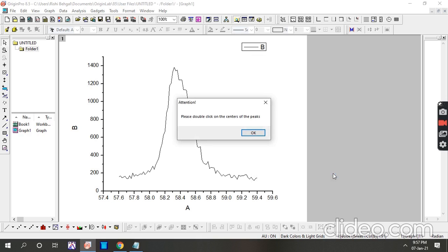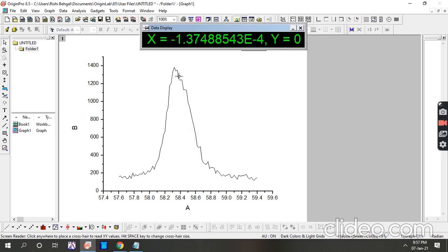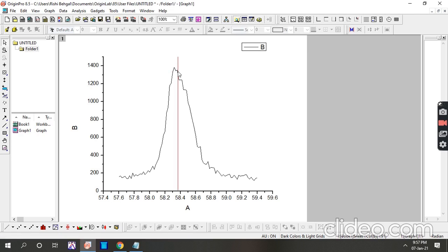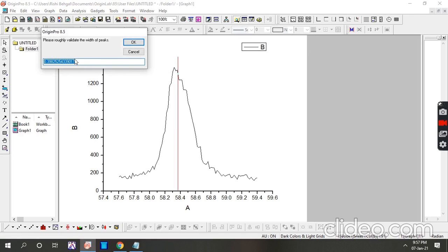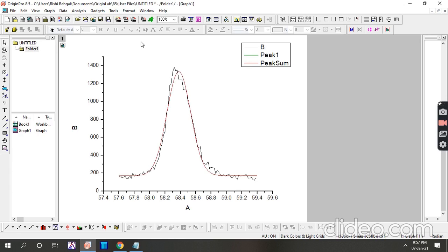Please double-click on the center of the peak. You can see approximately this will be the center of the peak. You can see our experimental data is in black color, but we have an origin peak — a curve fitting on our experimental data.